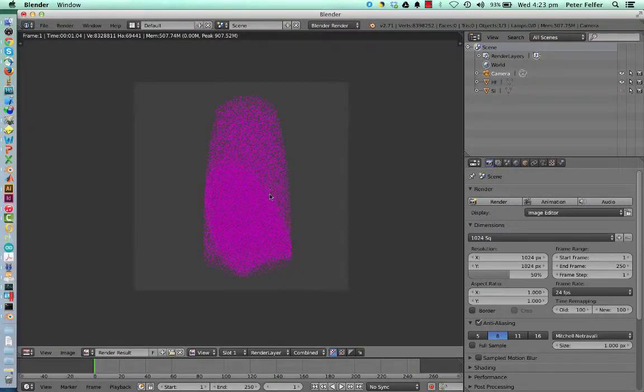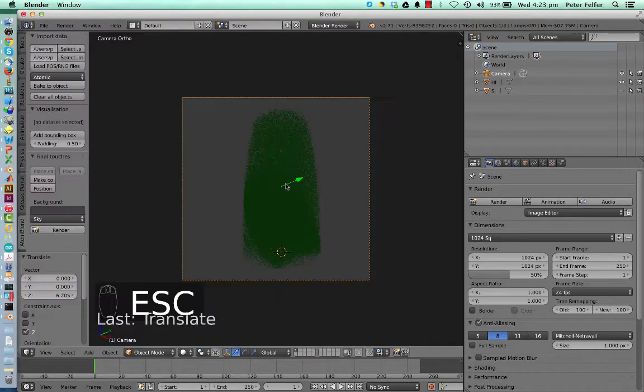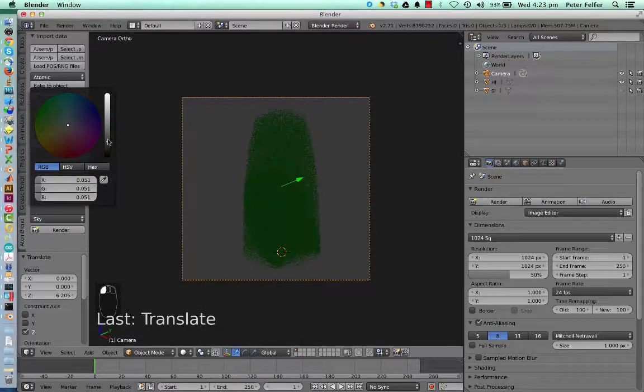So you can see this is your render. But there's a few things we might want to tweak. The first thing is we might want to have a background that's not gray. Depending on where it's going to go, you will probably choose either white or black. Just as a general rule, of course you might have your own reasons to do it differently. But for print you need a white background usually, and for movies you need a black background. That's just in tendency, but generally what we do is I'll just set it to a white background.